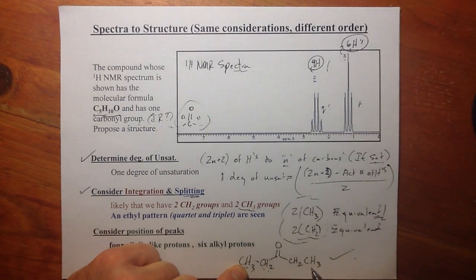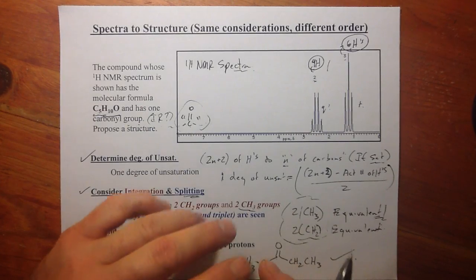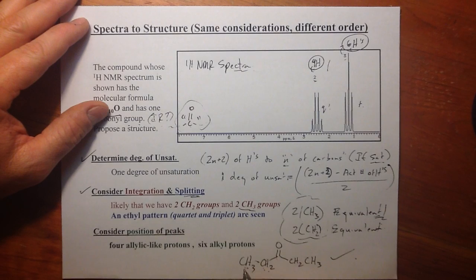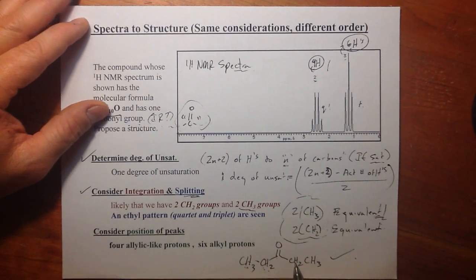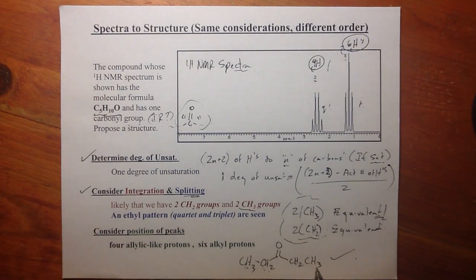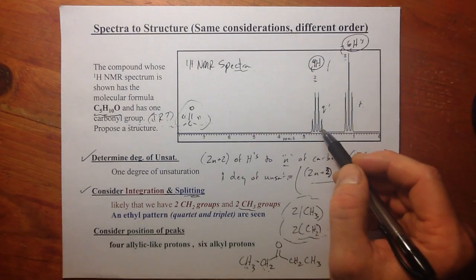And so, well, why don't I look at this side? Again, remember you can pick a representative of those 6. So pick either side, pick one. Whatever's true for one is true for all. We can do the same thing over here. I can pick any one of these 4 protons, kind of hold it and think, or put my pen on it and ask, what's its splitting look like? Where do I go? To my neighbor. So I go over here, I see 3. n+1 rule, I expect a quartet for these 4 protons. That's exactly what I see.